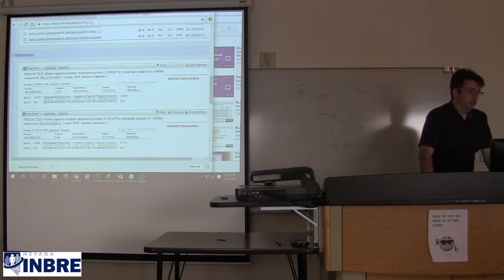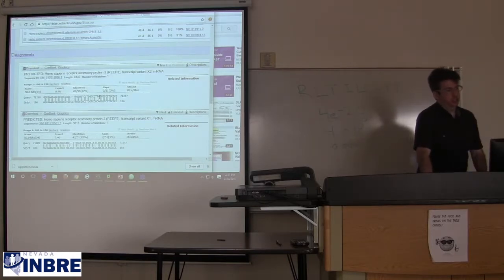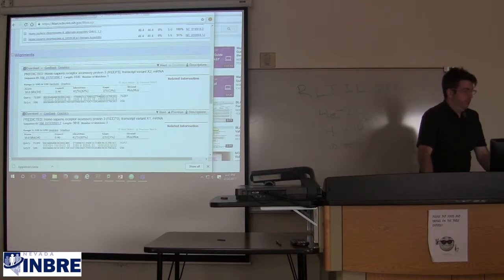And so the reason that Megablast didn't find this is because there's no point where there's 28 letters in a row that match or very nearly match. So Megablast would never seed a table with any of these to find the overlaps, whereas Blastn, which only requires 11 letters in a row, can attempt to initiate an extension based on any 11-letter sequence that is shared.